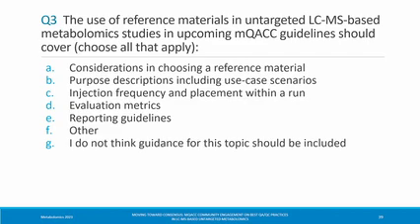Do you have any specific examples of when that's been important during a study? Yeah, I guess for certain metabolites, there are some differences in reported concentrations and abundances between serum and plasma, so there are some discrepancies between the specimen types. Plus, as you mentioned, those samples were collected at a certain time period. They might not reflect, say, exposures that are more contemporary, so there are going to be some noticeable differences. So more on the xenobiotic side, presence of exogenous metabolites. Yeah, so those samples might not be appropriate based on the context. All right, excellent, thank you.